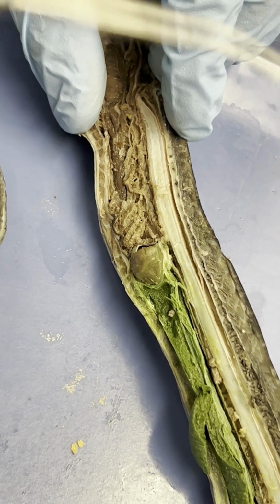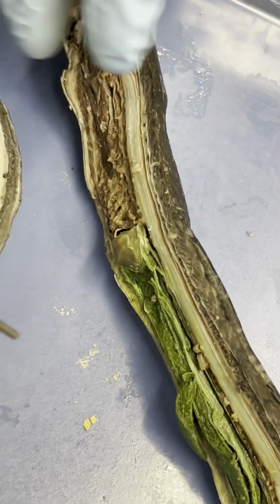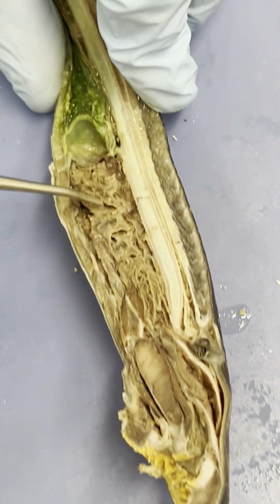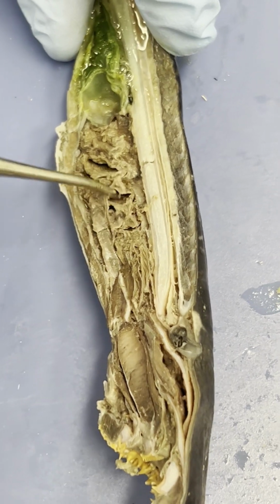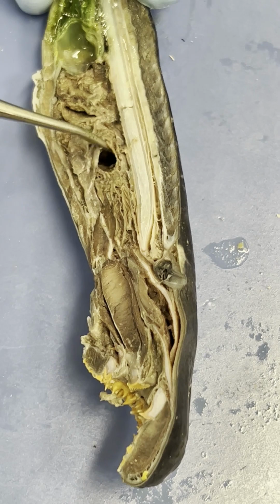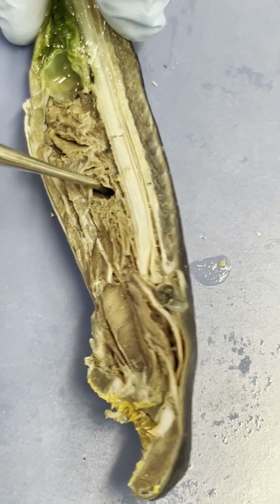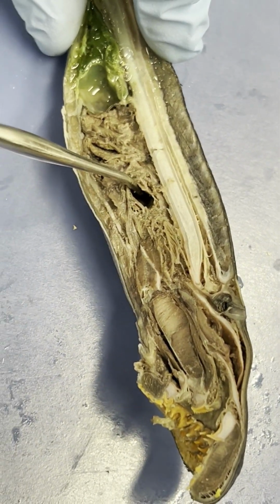Hopefully you guys answered that, or at least thought about it. But the gill slits might be easier to see, the internal gill slits on this side right here of the sagittal cut. Here's one opening of a gill slit. Here's another gill slit right here. And then here's another gill slit right here. And I could also, I'm not going to do it, but stick my probe through these external gill slits, and it undoubtedly will come out through the internal gill slits.